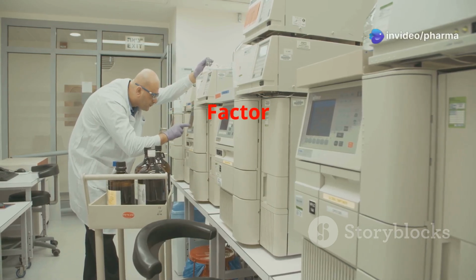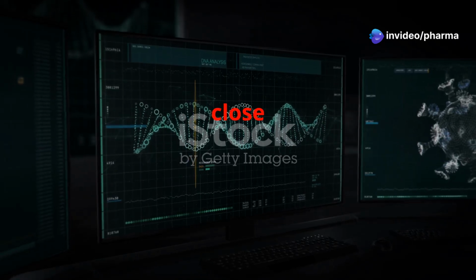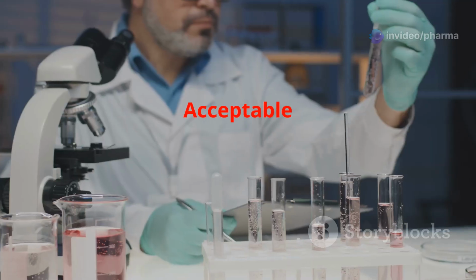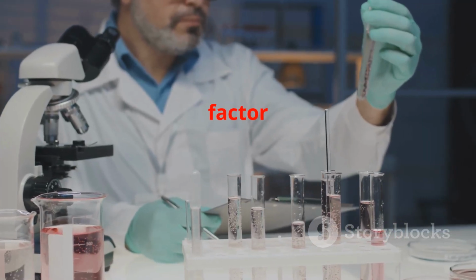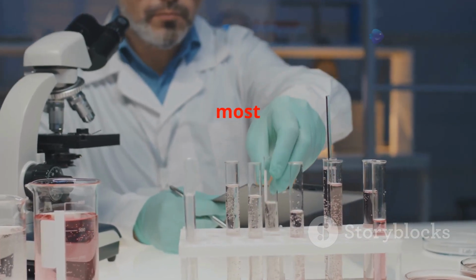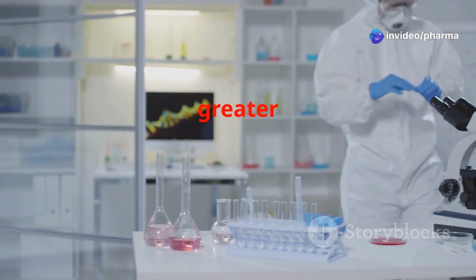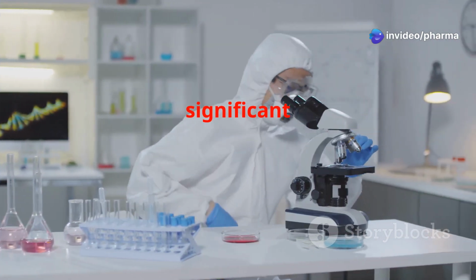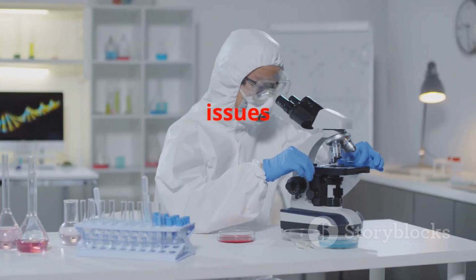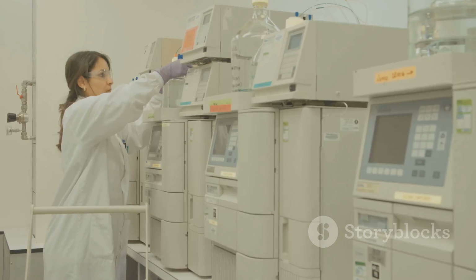Interpreting the tailing factor. Ideal peak: a perfectly symmetrical peak will have a tailing factor close to 1.0. Acceptable range: a tailing factor between 1.0 and 1.5 is typically considered acceptable for most HPLC methods. Poor symmetry: a tailing factor greater than 2.0 suggests significant peak asymmetry, indicating issues with column performance, sample overload, or other system issues.